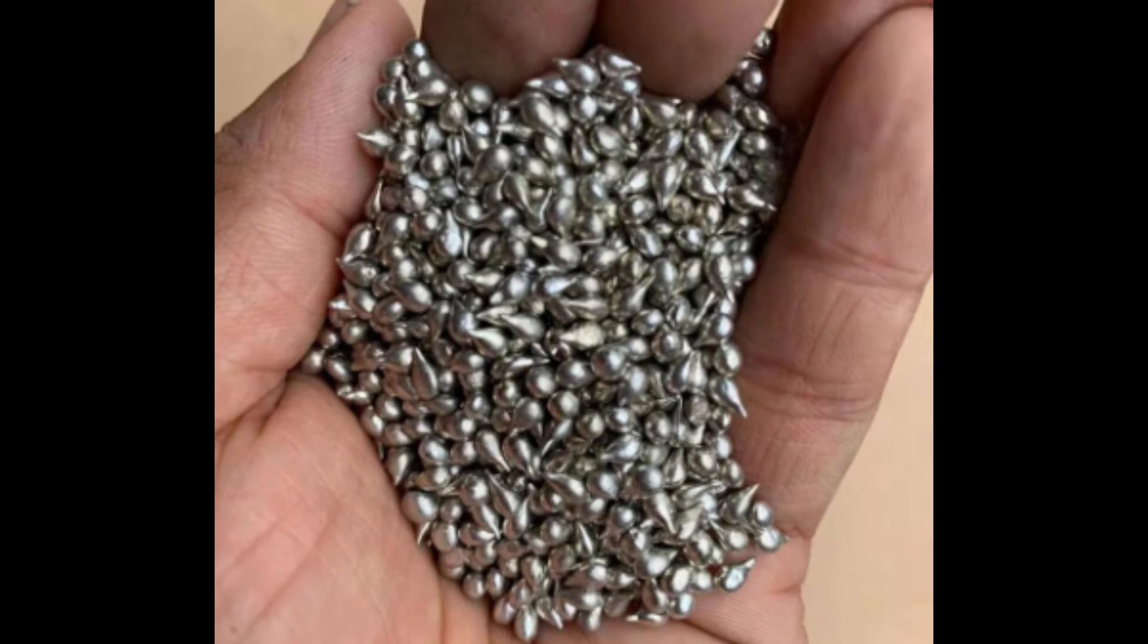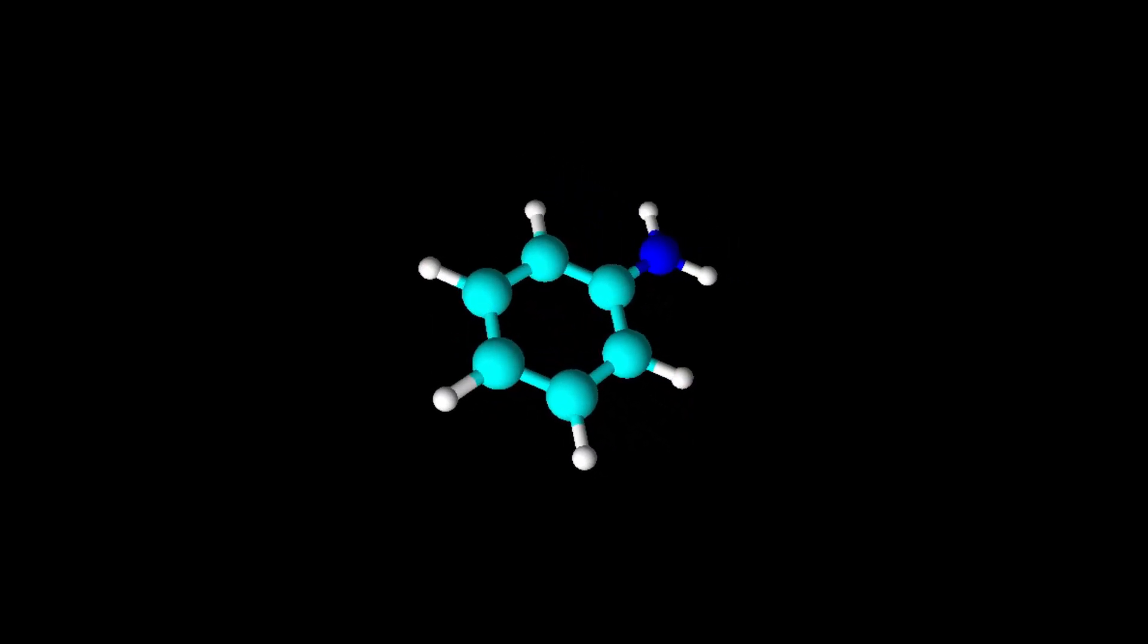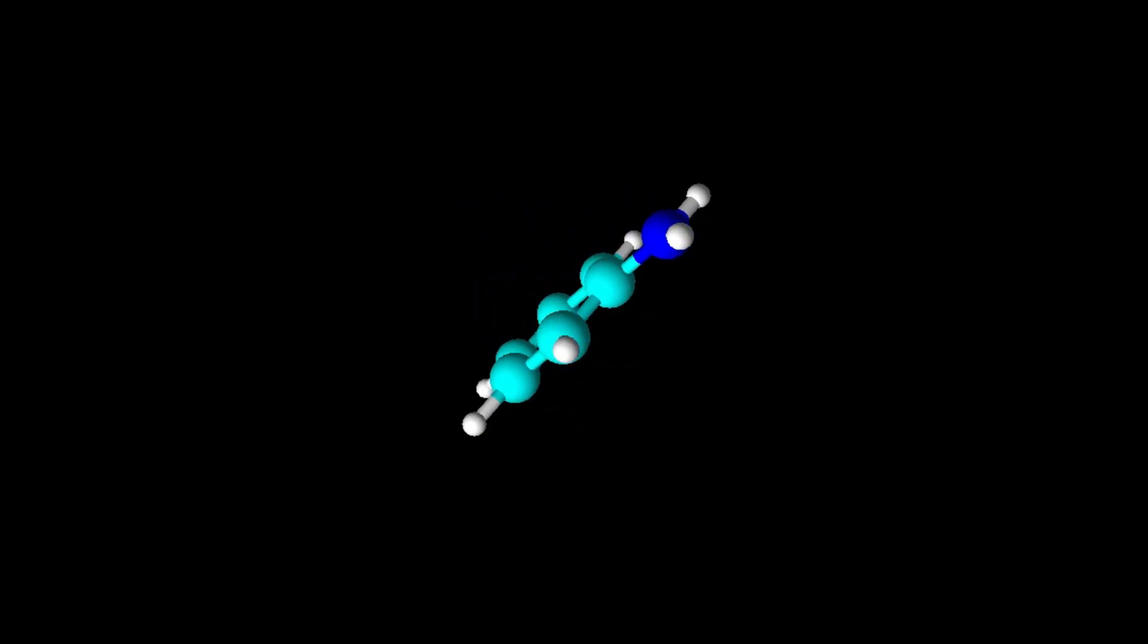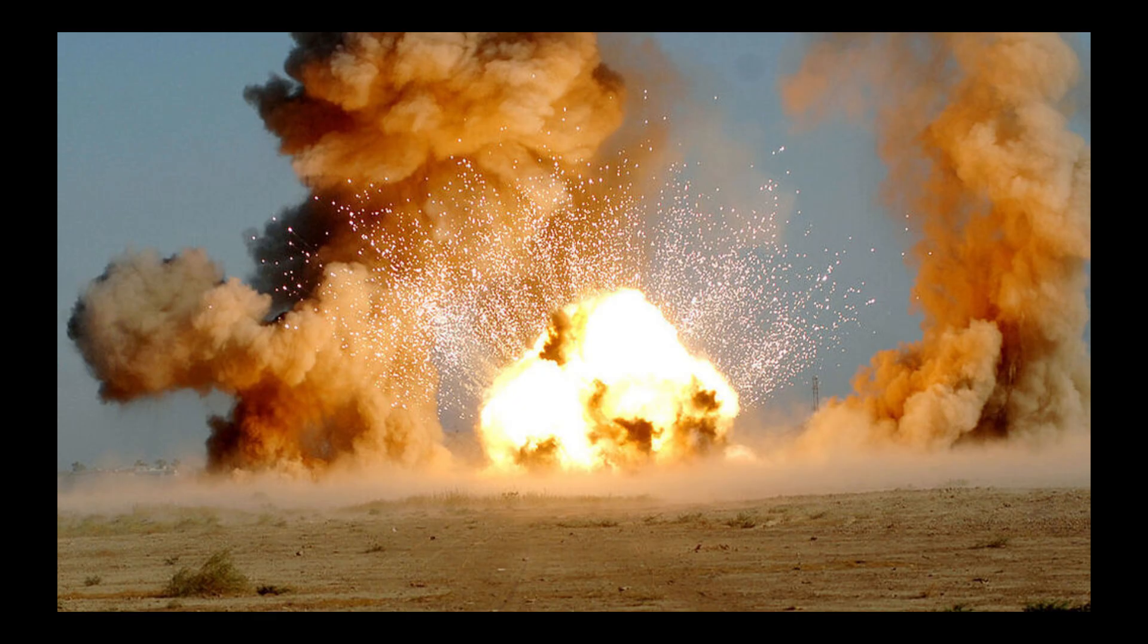This method is three times cheaper than reducing nitrobenzene with tin metal. Tin is more expensive than iron. Aniline is the most important aromatic amine.